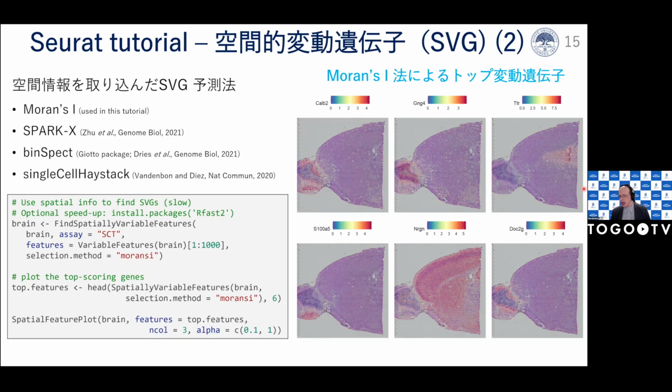I'm sorry. And then the second question: I would like to analyze the data using other spatial statistical methods with geospatial data analysis tools. And the question is, how can I obtain information such as the coordinate data of the spots? So this person wants to know how to get the coordinates. Actually, if you get the raw data of Visium, one of the files is, I forgot the name of the file, but it's something like the tissue location or tissue coordinates. It includes the X and the Y coordinates of every spot.